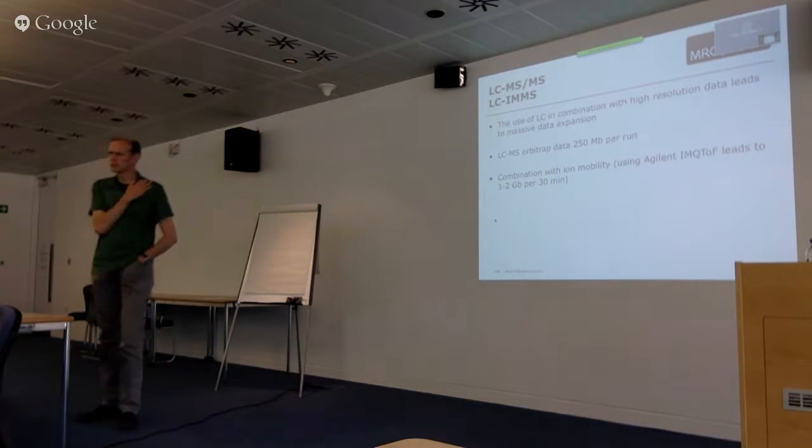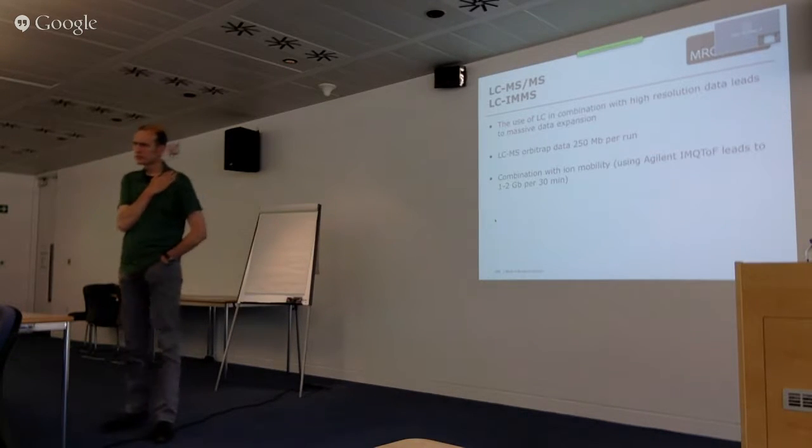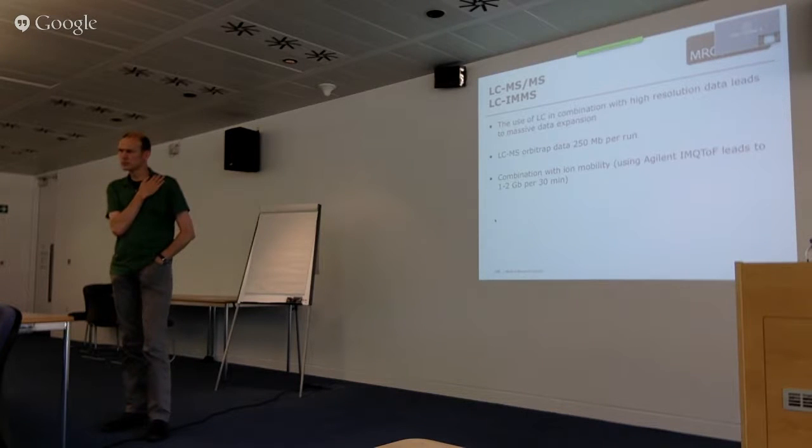I have a general question, coming from your slides, which is very intriguing: roughly 25% of samples contain QC, reference compounds, anything else. This is a general question, as well as to you, Albert.